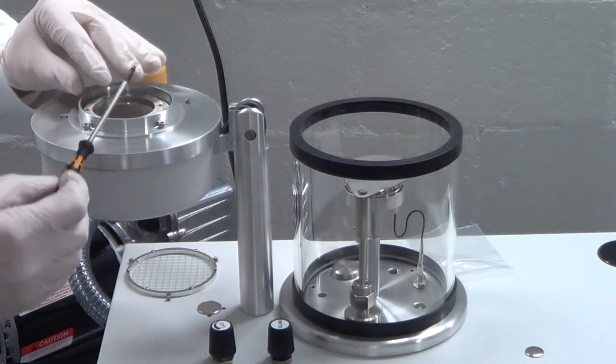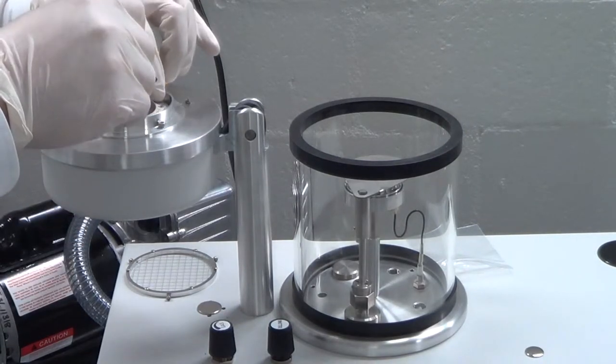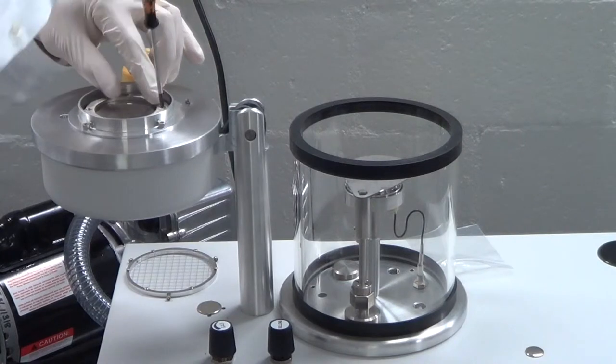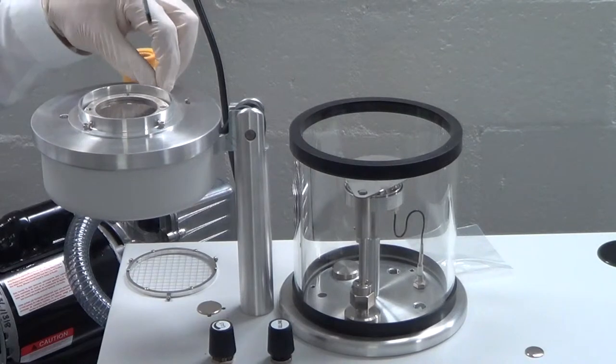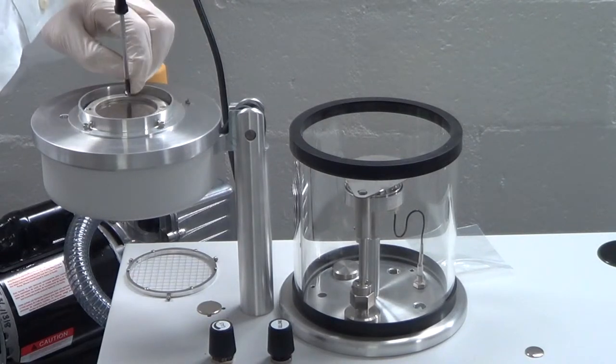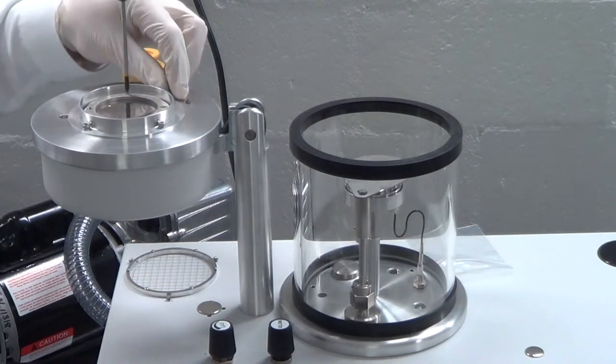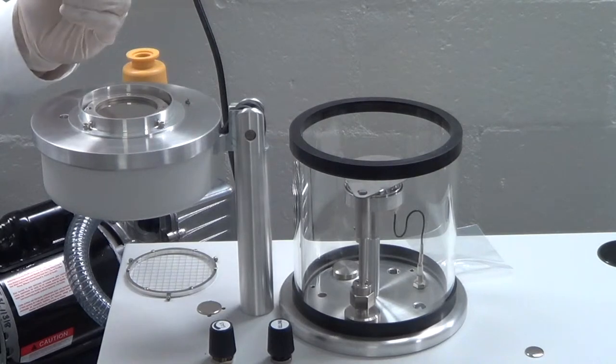Ensure the target is centered and the side of the retaining ring with the countersunk holes is facing up. Reinsert the four screws into the retaining ring. Do not tighten them all the way just yet. This will allow you to move the target if it is not centered properly.